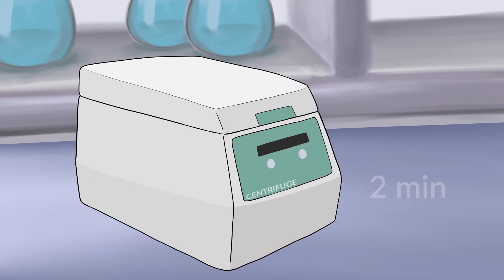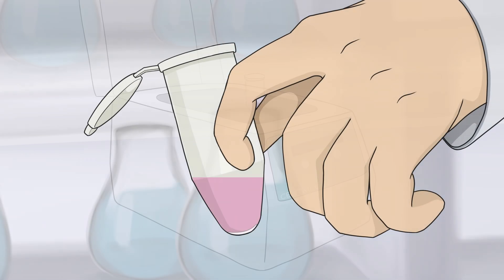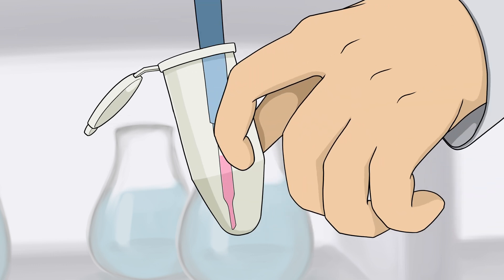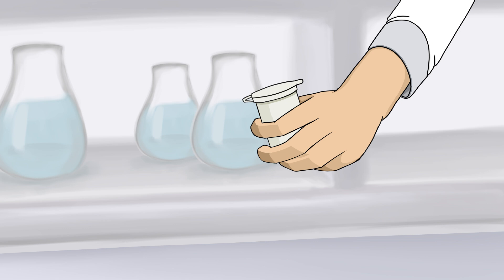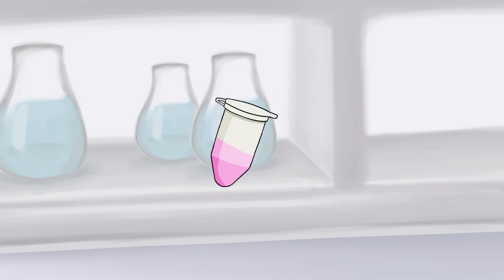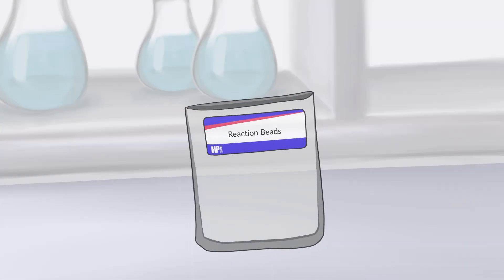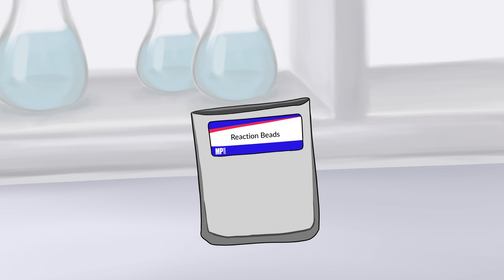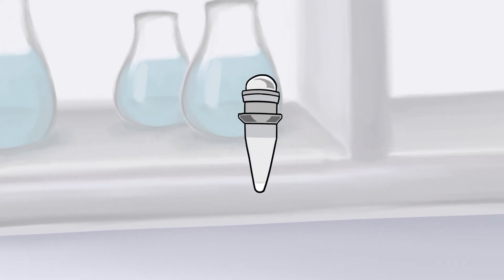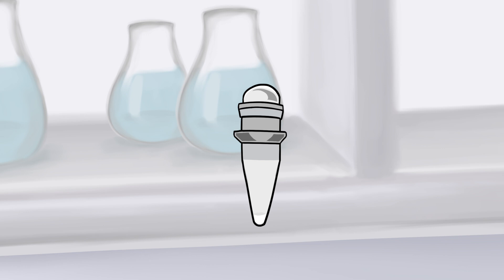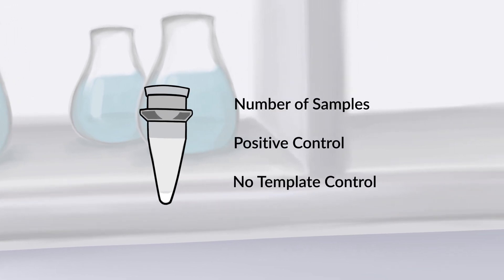Carefully transfer the supernatant to a fresh 1.5 milliliter centrifuge tube. The supernatant is now ready to be used immediately, or it can be stored at minus 20 degrees Celsius for later use. Next, we need to prepare the reaction mix. Begin by taking an appropriate number of reaction beads provided in individual tubes. Prepare the amount based on the number of samples, positive control, and no template control.